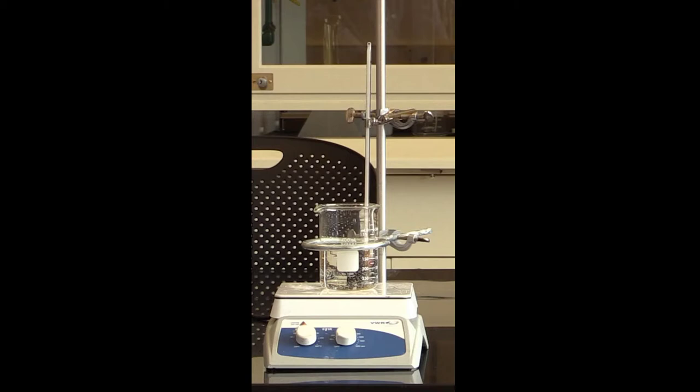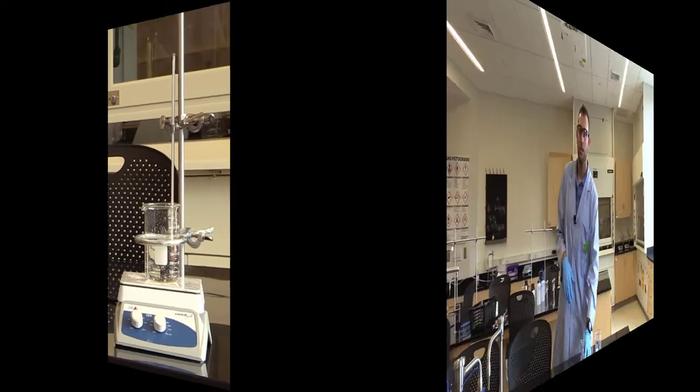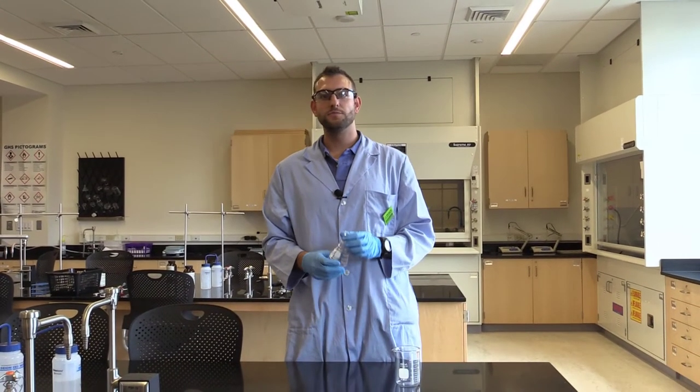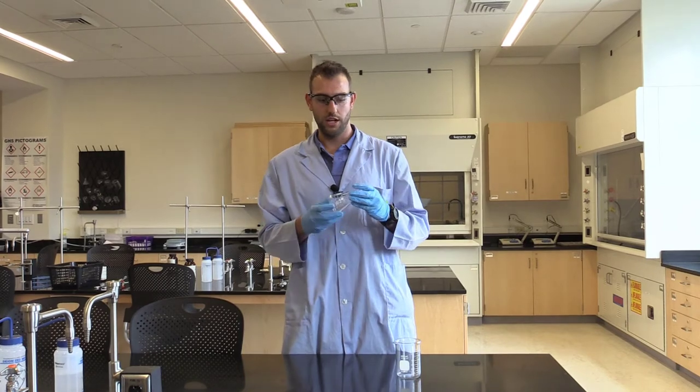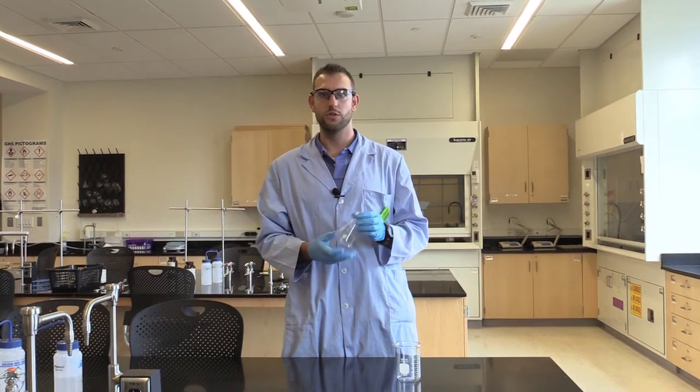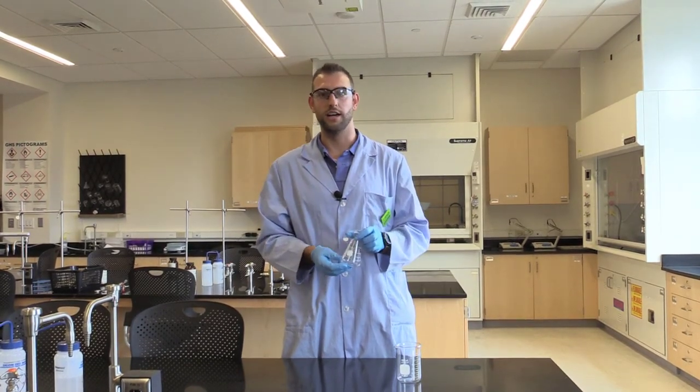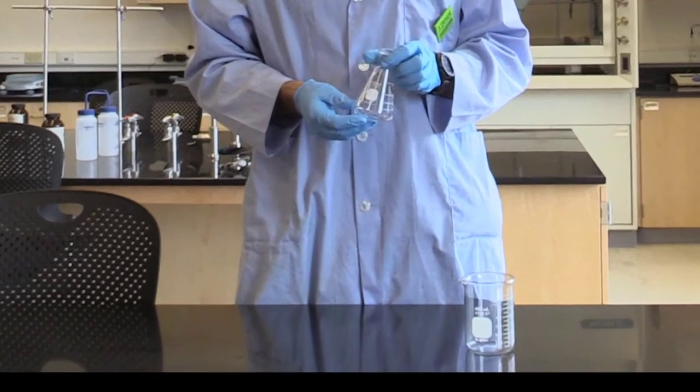While this is heating up, we'll set up our reaction vessel. We want to make sure we're using a dry 125 mL Erlenmeyer flask. The reason we need to make sure it's dry is because the chemicals we're putting in it will react with water. If there's any water in here, we're not going to get a good yield.